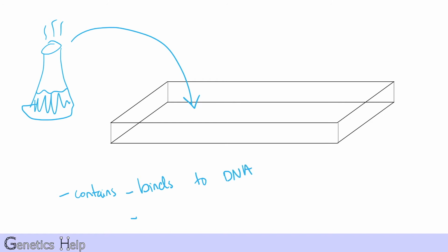And it lights up in UV light. So what's going to happen is when we have our DNA inside of the agar, the DNA is actually going to be bound by molecules inside. It can be different things. Sometimes ethidium bromide was commonly used a few decades ago. They're kind of phasing it out because it's a very potent mutagen. It actually binds between bases, so it's not a very safe chemical. So we have some alternatives.